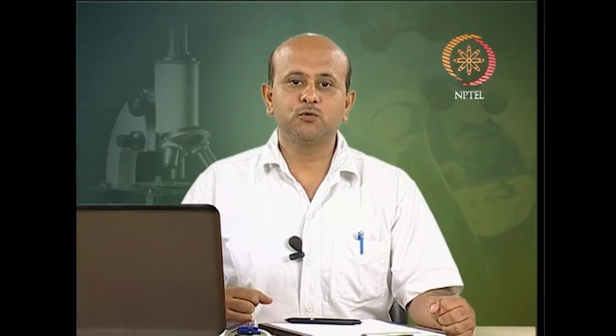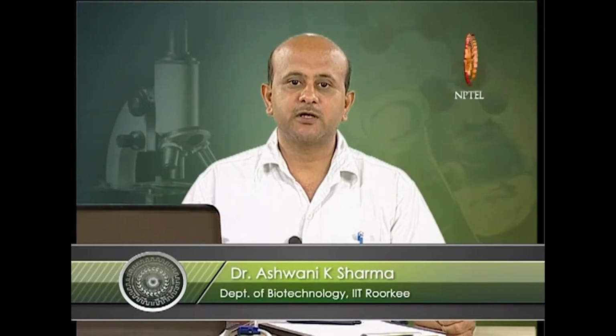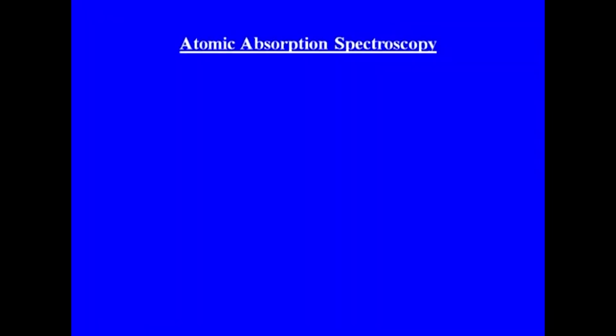In this lecture, we are going to discuss two techniques. One is atomic spectroscopy and the second one is mass spectrometry. Both are very useful techniques for application in different areas of biotechnology. Now, let us first discuss atomic spectroscopy.